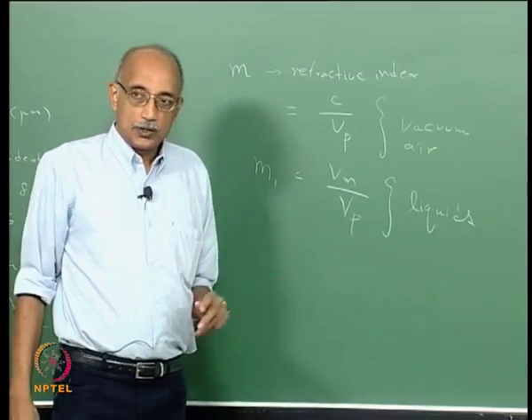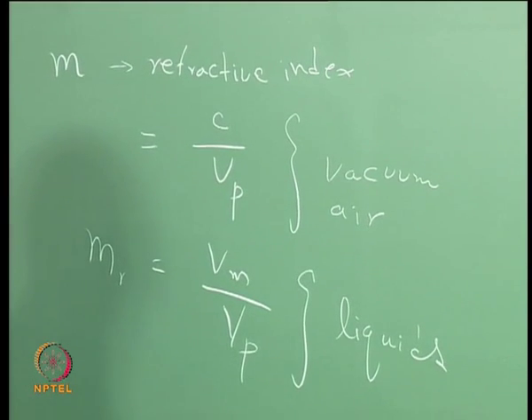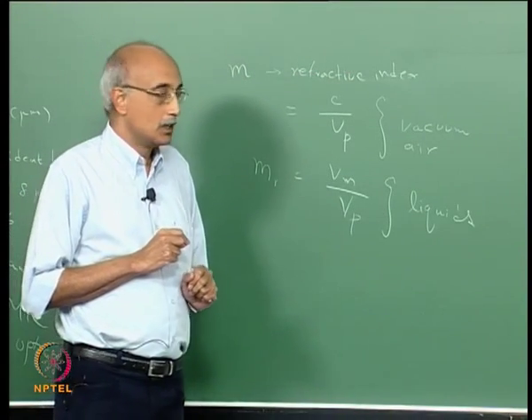In the discussion that follows, just for simplicity's sake, we will use m as the refractive index, but keep in mind that when we talk about m, in the case of particles in liquids, what we are really talking about is the relative refractive index.